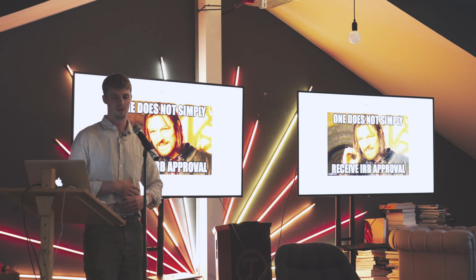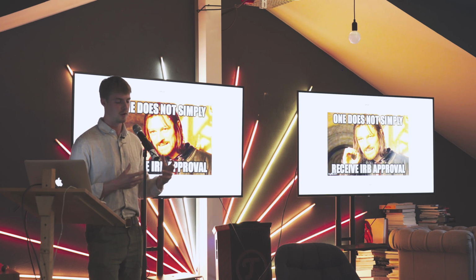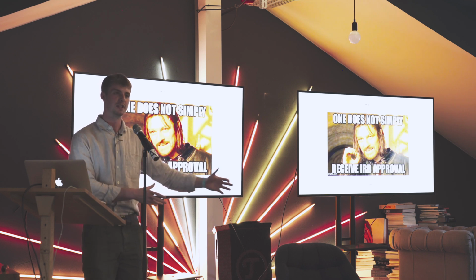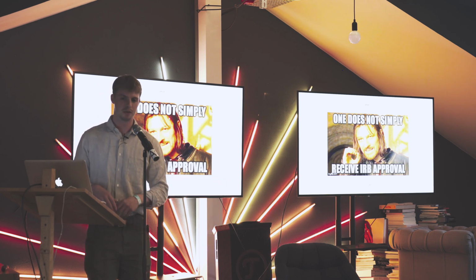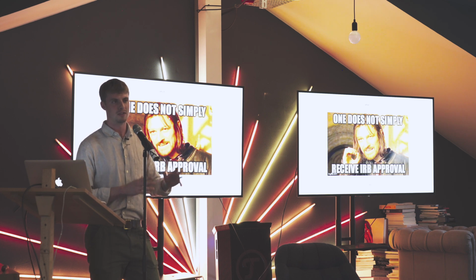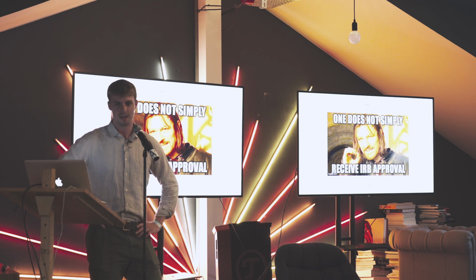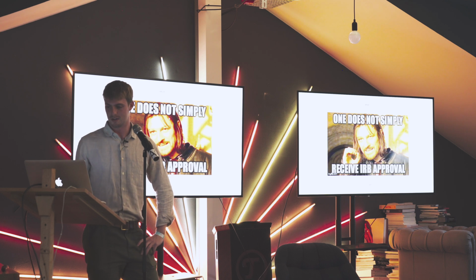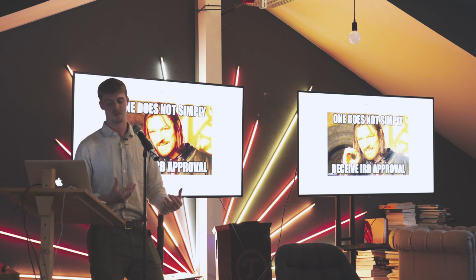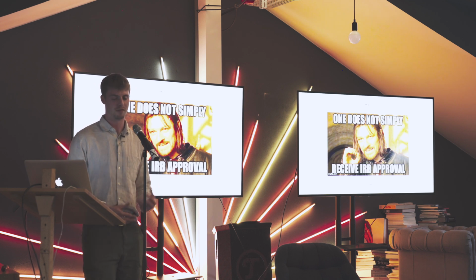And so one thing that I think could be really interestingly integrated into LabDAO, say if they want to delegate a specific task to a laboratory, you'd be able to have this constant flow of data and know exactly when the samples were taken out of the fridge, when the tests were conducted, say with motion sensors within your fume hood, and then have all of that background data sent up to the cloud along with all the essential active data associated to the tests, which I think is an interesting full view of all the data that you could potentially get out of a laboratory. And you could basically make these reproducibility errors a thing of the past.